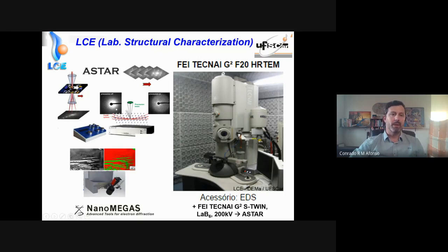We get a lot of nanobeam diffraction patterns corrected by precession electron diffraction, collected at a step size on the order of 5 nanometers, a little bit more or less. And we map the crystallography of nanostructures: samples processed by severe plastic deformation, nanocrystalline alloys in general.